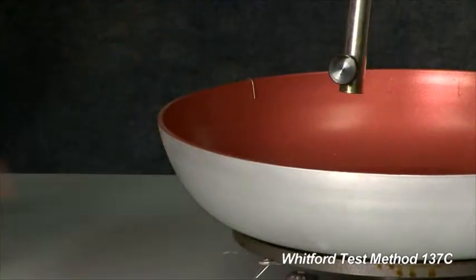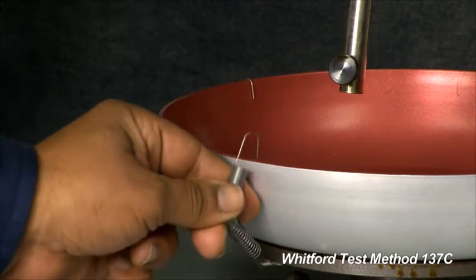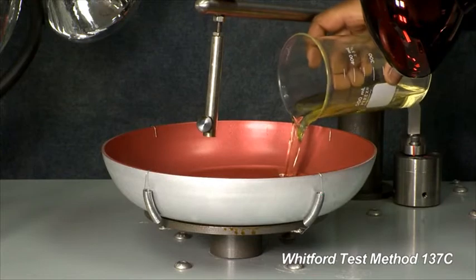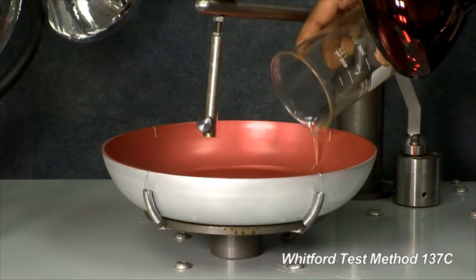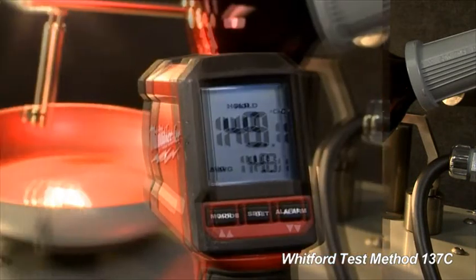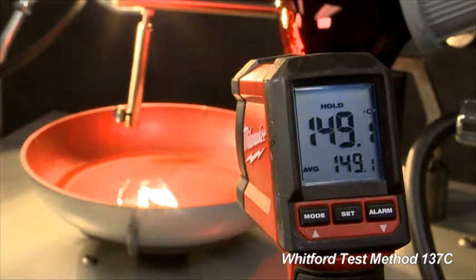First, secure the test pan to the machine with clamps. To simulate normal cooking conditions, the pan is covered with oil, then heated with infrared lamps to a cooking temperature of 150 degrees centigrade or 300 degrees Fahrenheit.